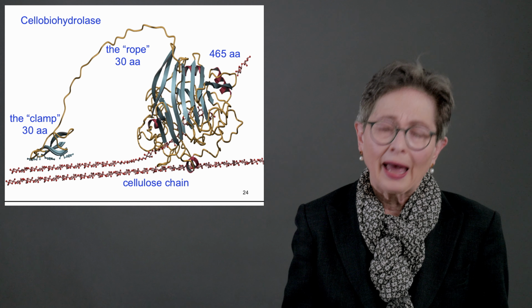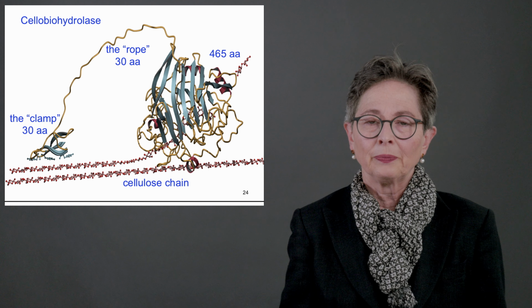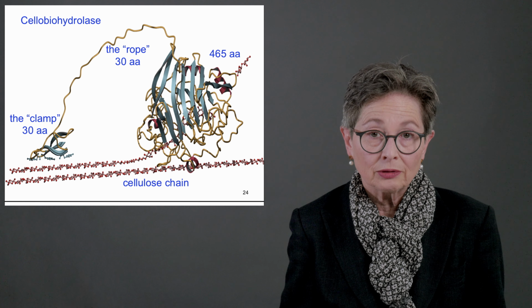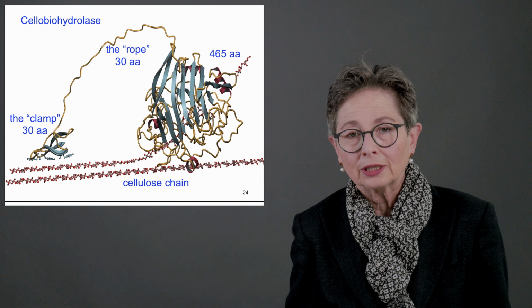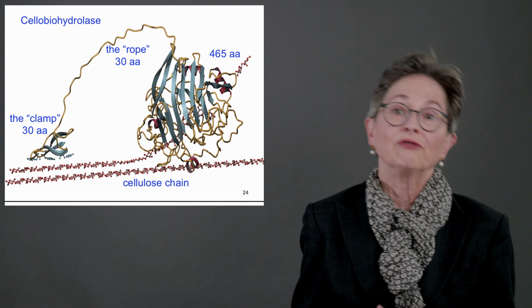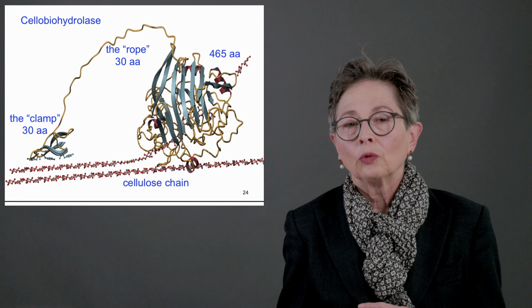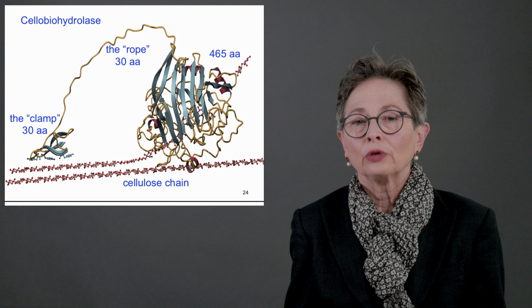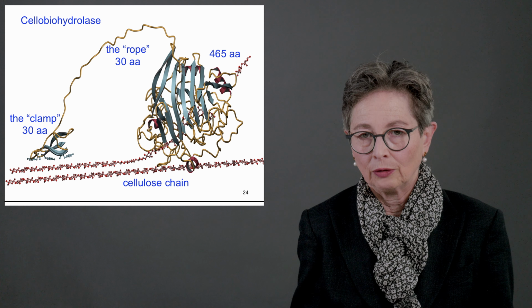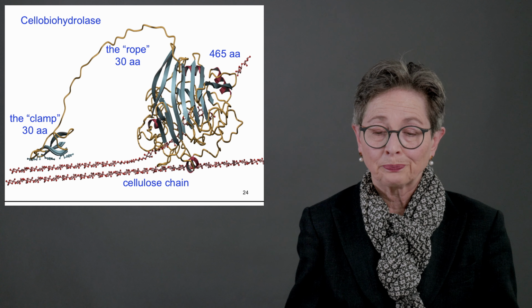Well, this was done back in the dark ages, before molecular biology was even invented. So we chopped the protein up using proteolytic enzymes and then tried to crystallize the pieces by themselves. I call this the divide and conquer method. Nowadays, we would simply clone different domains of the protein and try to crystallize them separately. Then you put the whole picture together.